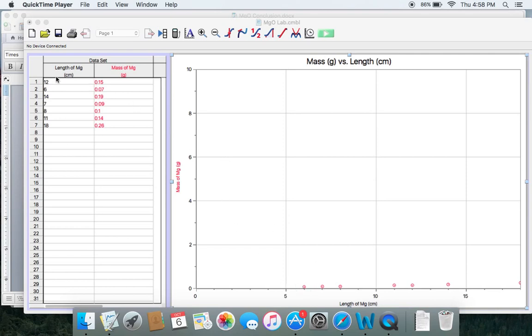Just depending on which class you're in, you might have anywhere between six to nine different data sets, because some classes were smaller, others were larger — it just depends.